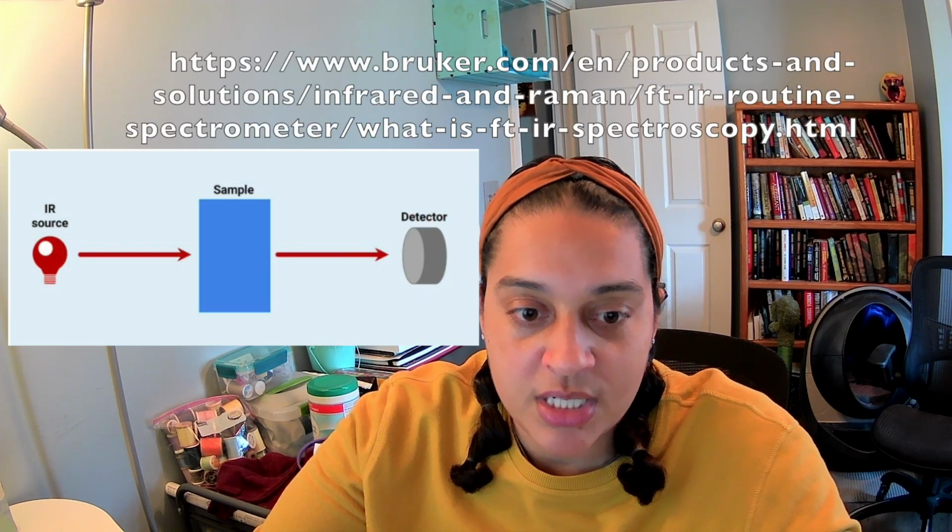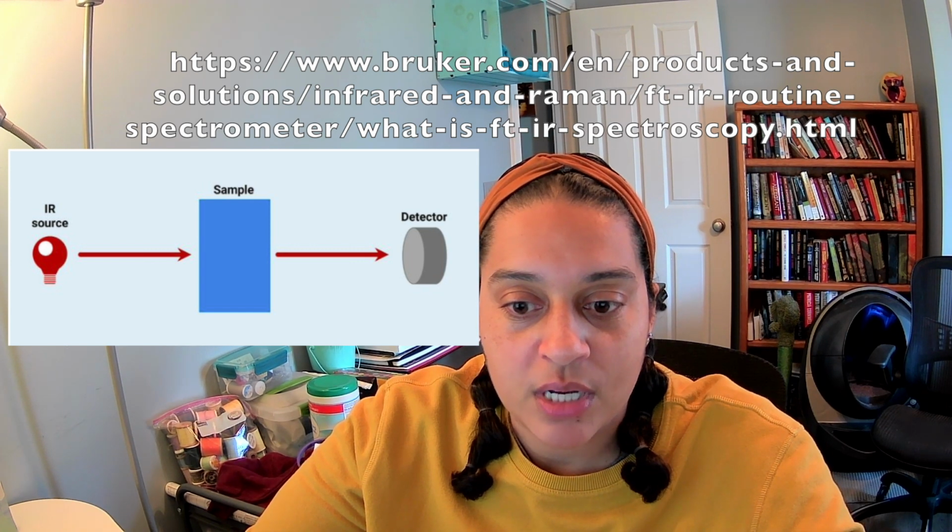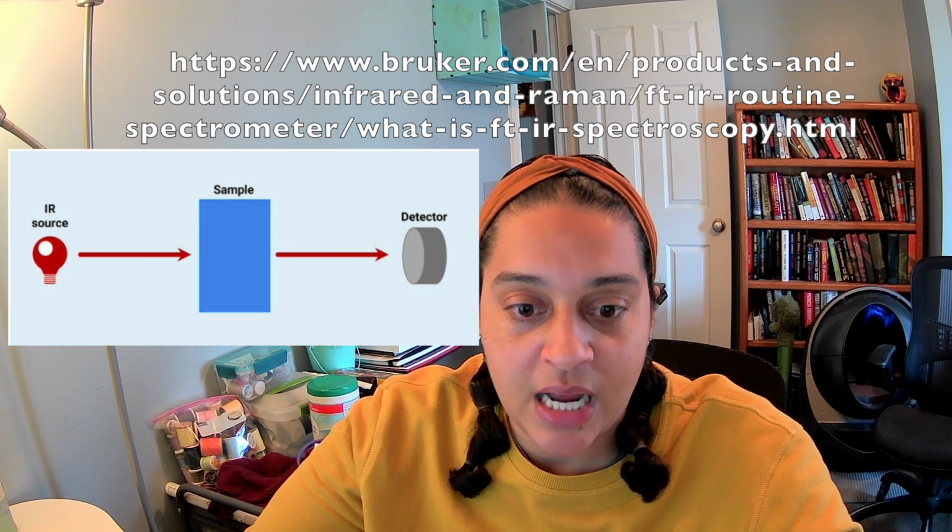Transmission, which is a technique where light is passed through a sample. This technique can be a little difficult since if the sample is too thick, the light cannot pass through the sample, giving poor quality or messy spectra. This is also known as total absorbance. Sometimes samples will be diluted to help eliminate issues of total absorbance, but whatever the sample is mixed with needs to not absorb the same range of frequencies as the sample, as what you're interested in is the sample. Dilution will usually mean the sample is destroyed.